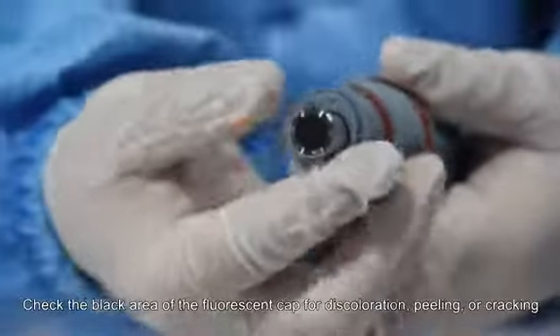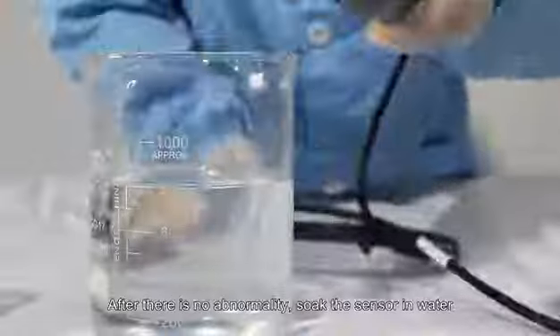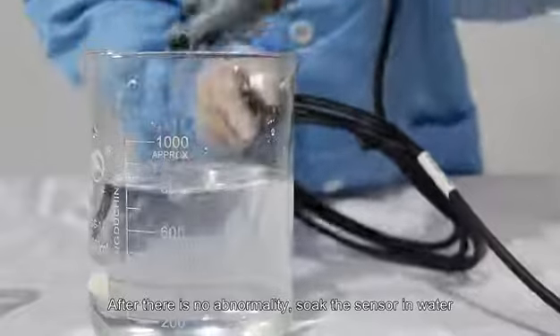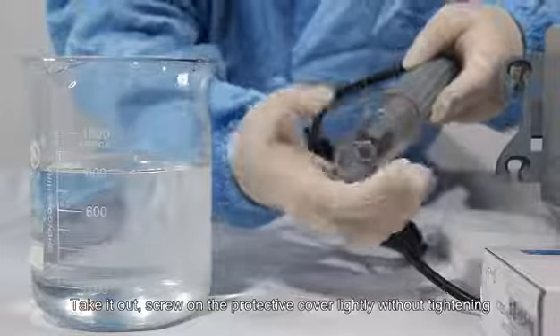Check the black area of the fluorescent cap for discoloration, peeling, or cracking. After there is no abnormality, soak the sensor in water, take it out, and screw on the protective cover lightly without tightening.